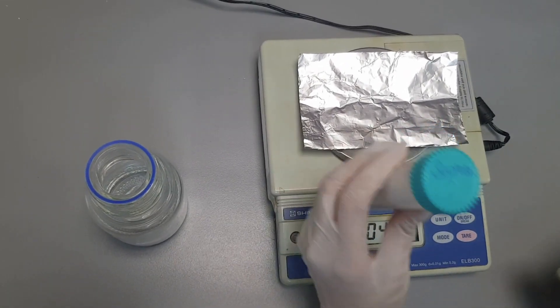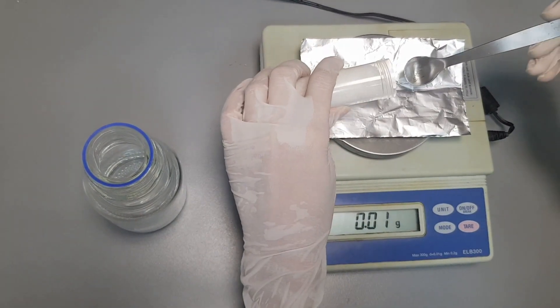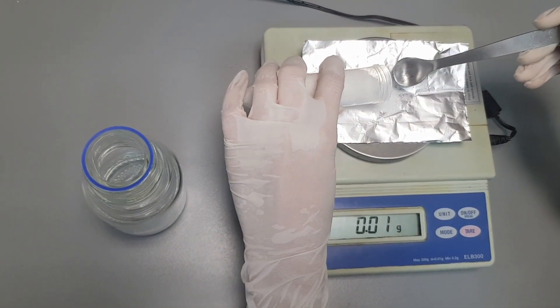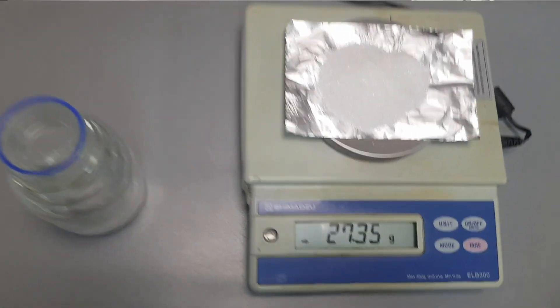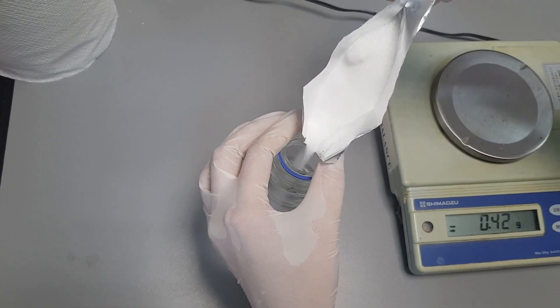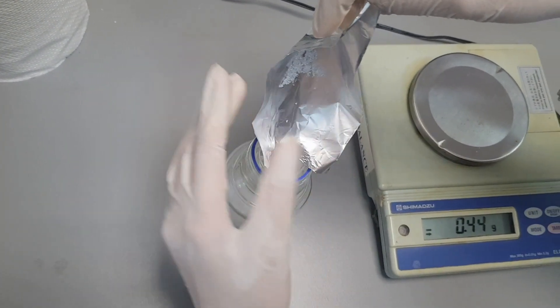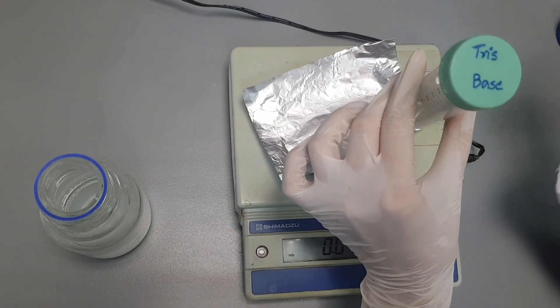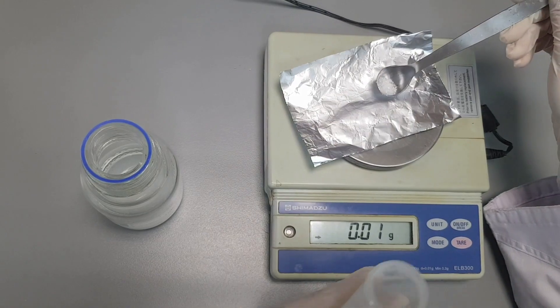Now weigh 27.3 grams of sucrose and add it to the reagent bottle. Now measure 0.32 grams of tris base and add it to the solution bottle as well.